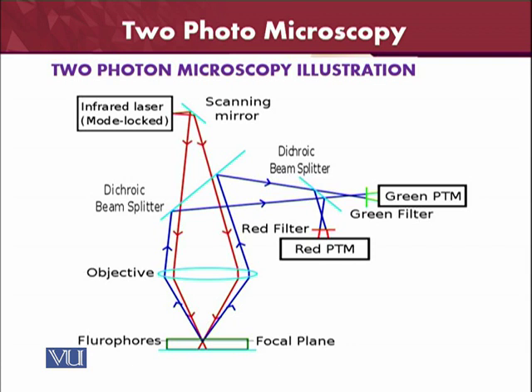and it will again be stopped by the dichroic splitter, and it will make the object below the dichroic beam splitter clear. Similarly, the red filter and the green filter will be on the right side, and the light will be coming from there, and the fluorophores and the focal plane will make the object clearer.